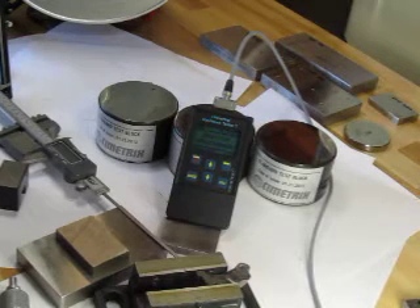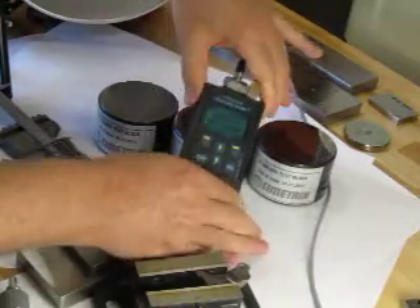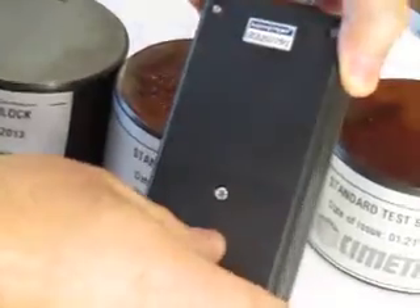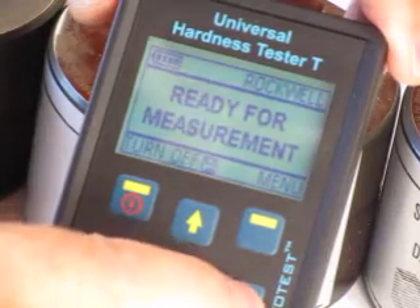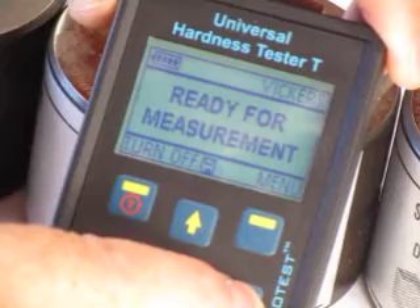Today we're going to be showing our ultrasonic hardness tester. It's an extremely compact device with rechargeable batteries in the case, a backlit display. On the display we can set it for Rockwell, as we have in this case, or hit the scale button to do it in Brinell or Vickers.